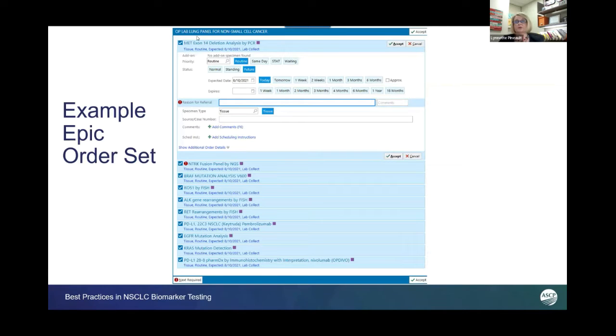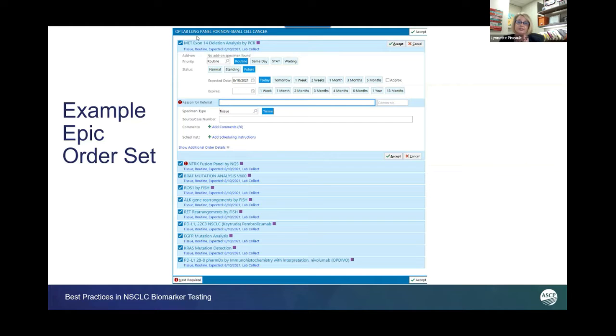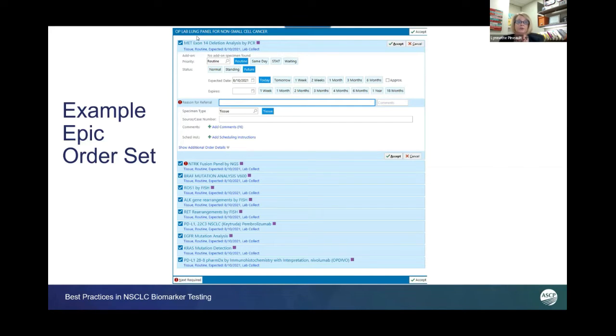Here's a simple screenshot of what we pulled together between our oncology teams for our biomarker testing panel.